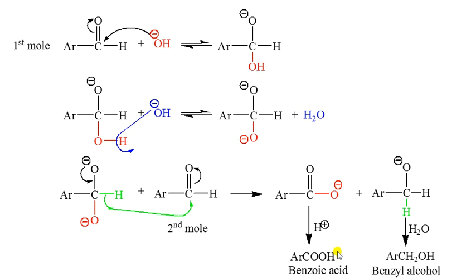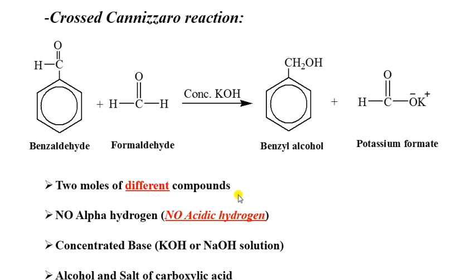To increase this yield, we will use another aldehyde, or different aldehydes.